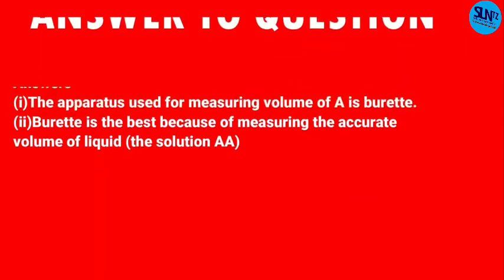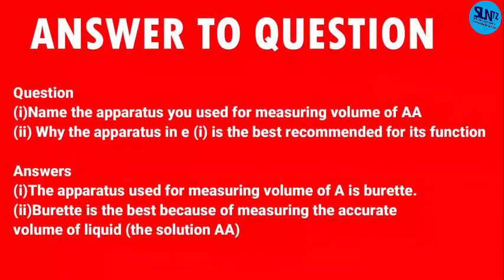What is the apparatus used for measuring the volume of solution A? The apparatus used for measuring the volume of solution A is the burette. We use the burette because it is the best for measuring the accurate volume of liquid, which is solution A.